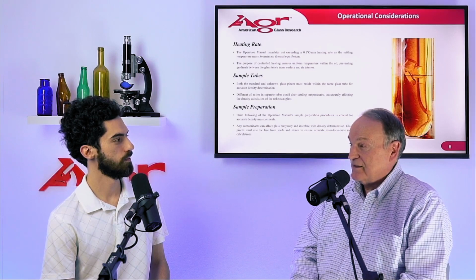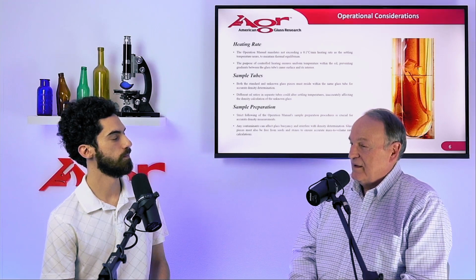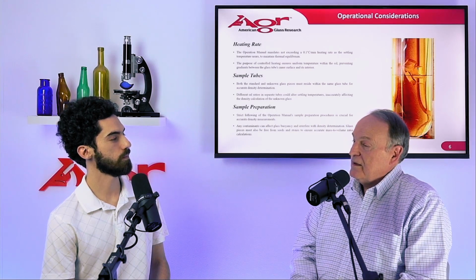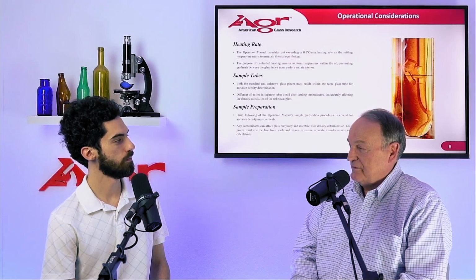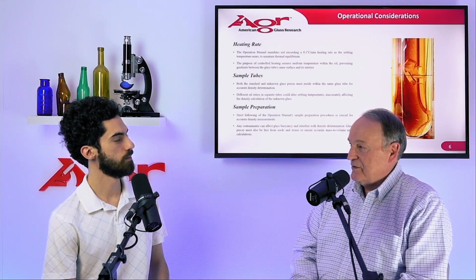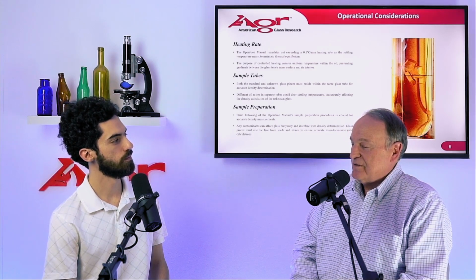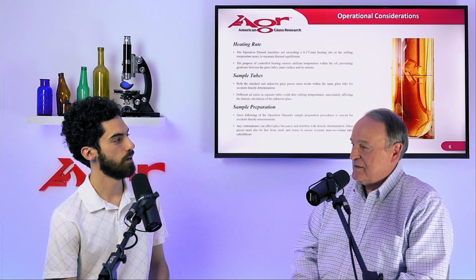You may not even detect it. When that goes into the oils, it's not miscible, and it can turn these oils dark. These oils are also bromine compounds, and they are sensitive to ultraviolet light, and that will darken the oil. Again, it doesn't affect the accuracy of the measurement, but it makes it very, very difficult to see the pieces of glass as they fall past the reference line.